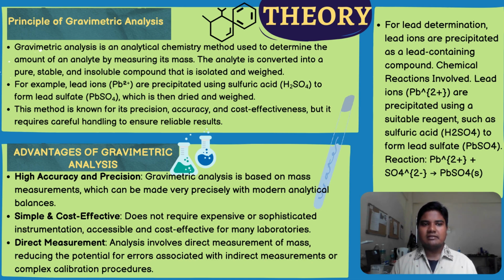And lastly, it is a direct measurement. The analysis involves direct measurement of mass, reducing the potential for errors associated with indirect measurement or complex calibration procedures.